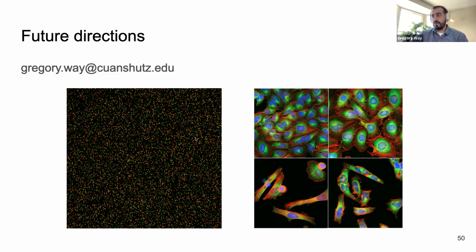Our mission is to take this image on the left, this is a microarray, and there are standard bioinformatics practices. No one ever has to look at these data, because there are so many common tools that are well established that can analyze this data and convert these images to gene expression readouts. We want to develop the tools that can enable people to analyze these data just as easily, because I think it's going to give you a lot of information that you're not going to get from this, and it's also amenable to other experimental designs that are going to be unique to the data type.